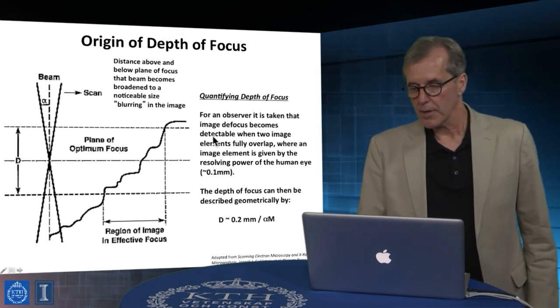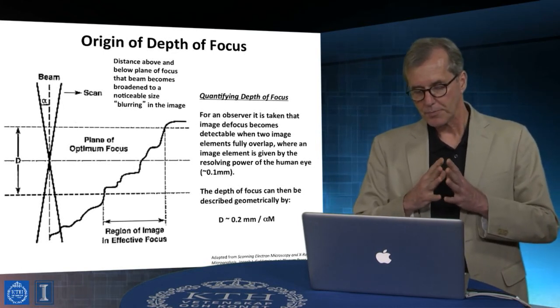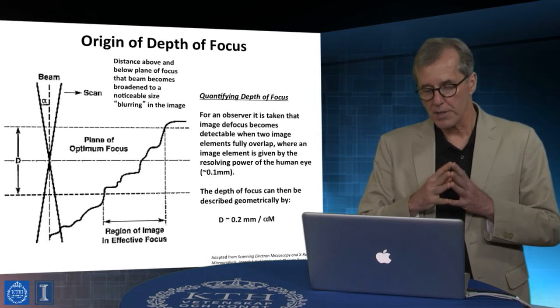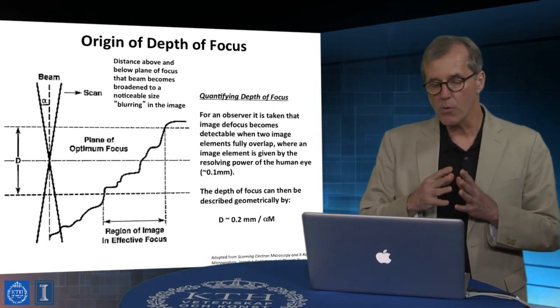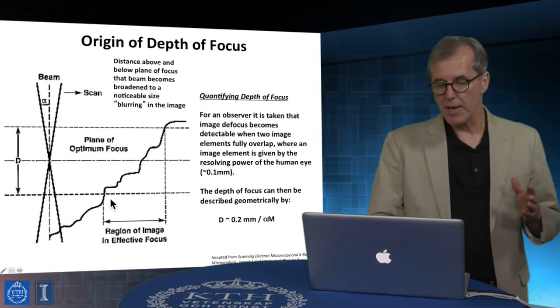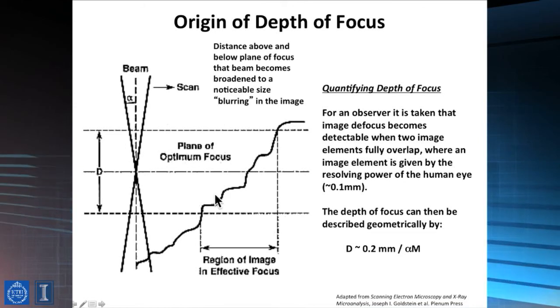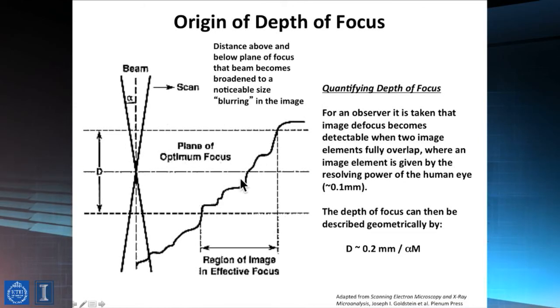And this actually has really an important consequence for how we might do the imaging. And the other part I would mention is that we have to worry about things related to not only topology but surface tilts as well.